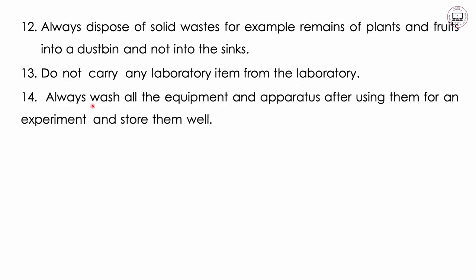Then 14, always wash all the equipment and apparatus after using them for an experiment and store them well. Store them well. This is very, very important.